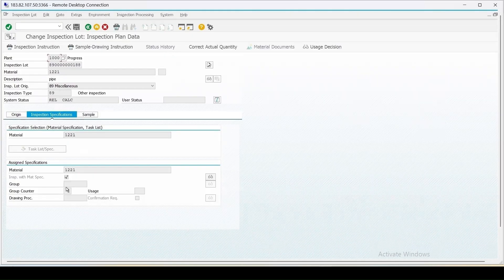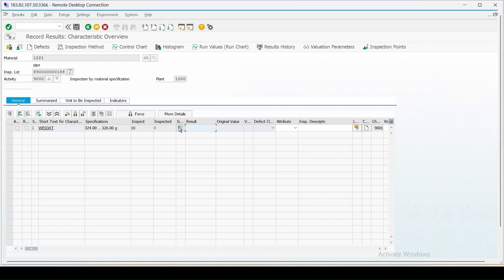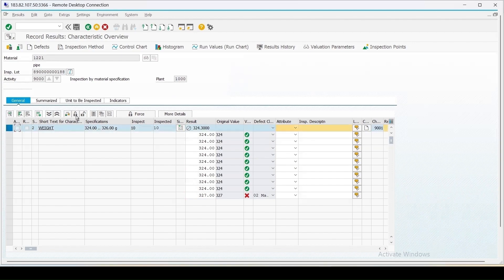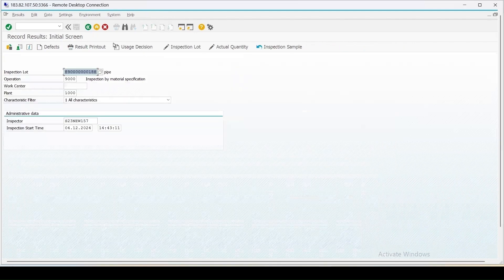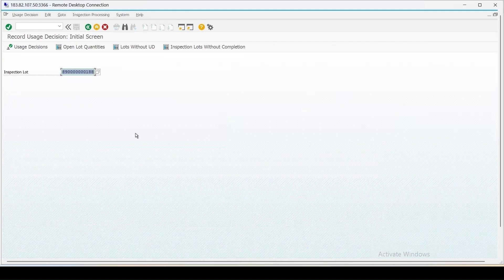Normally if we are using an inspection plan, the plan details come with the group and group counter details. Let's save it, and we can do the result recording. I am entering some values - entering 327 for one, close it, accept it, save it, then proceed to the usage decision for the same, enter the UD code, press Enter, and save it. This is how you can use the material specification.